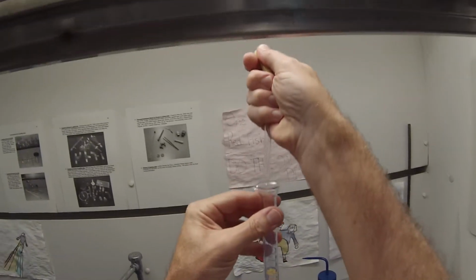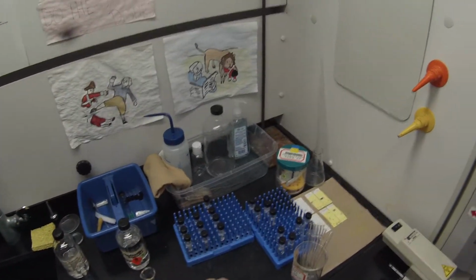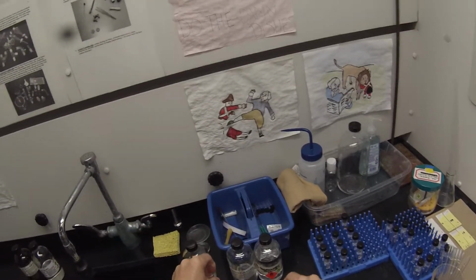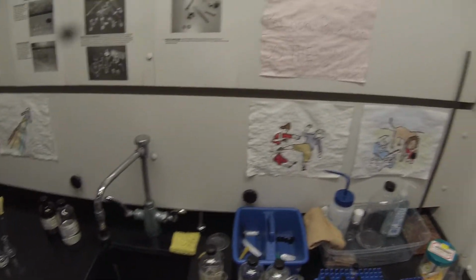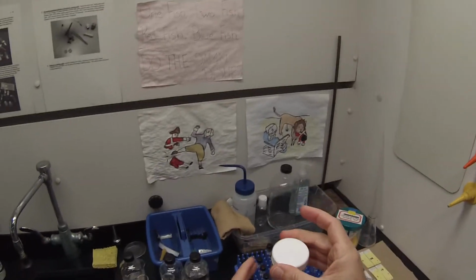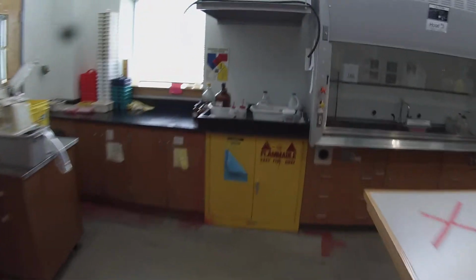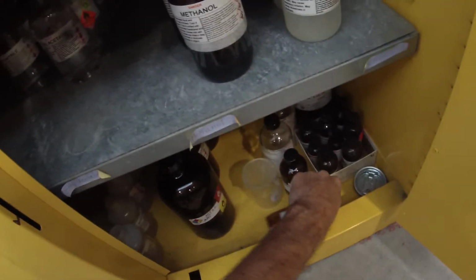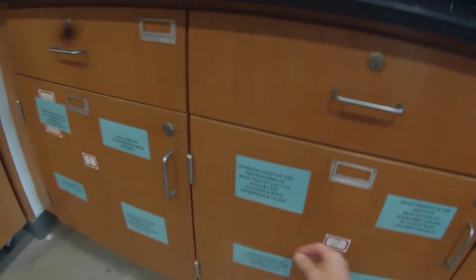The other thing when one is running TLC on amines is it's frequently desirable, in order to keep the amine from getting protonated by the relatively acidic silica gel, to add a little bit of triethylamine so that if it does try to get protonated, it will immediately react with the triethylamine. So I'm going to add some triethylamine to that chamber. I think there may be some triethylamine already in the flame cabinet. If not, I will have to go and find some. Looks like there isn't any here. And one other place I can look in the lab. So the triethylamine is a stronger base than the tryptamine in all likelihood.